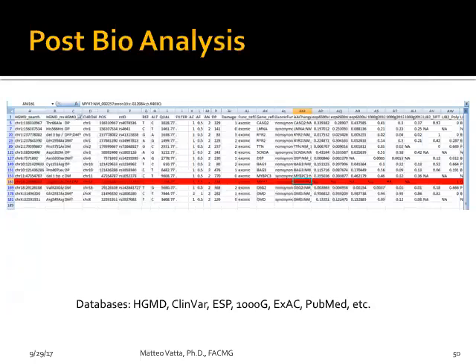The other thing that is key is to have the gene of interest and the type of variant that occurs. In this case, it is a missense variant. And I believe, even though you cannot see and I cannot see, it is an arginine 403 to glutamine change, which is the most common variant in myosin heavy chain 7 causing hypertrophic cardiomyopathy. So there are a lot of databases that you need to pay attention to, and a lot of parameters.